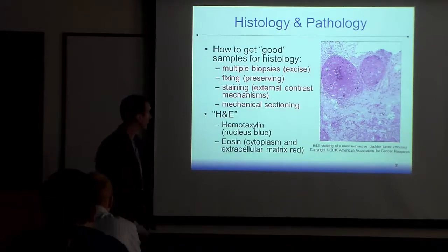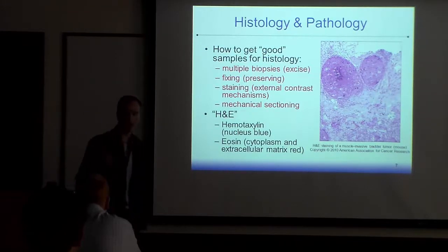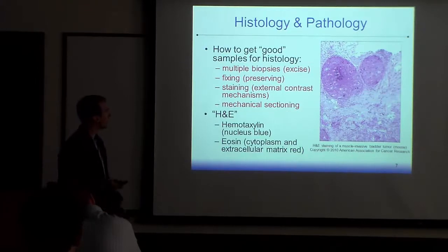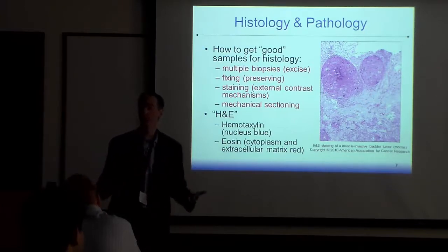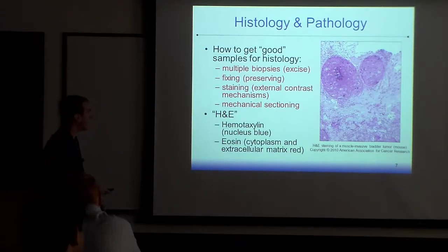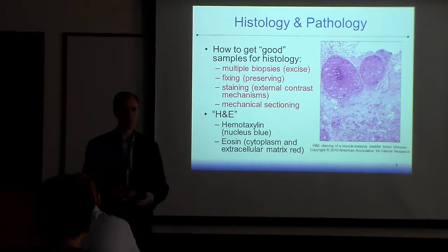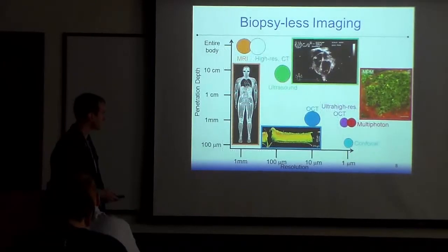Okay, so the things that I'm going to talk about and trying to address a little bit are these areas of, well, what can we do to reduce the need to cut out things. We want to look at stuff that's inside of tissue without actually having to remove the tissue, so we can look at it while it's still alive. We want to not fix it, and I will use some external contrast mechanisms, but we also want to look at what your tissue can do just naturally without having to label it, because there's a lot of information in there. And yeah, we don't want to have to slice up your tissue. You want to keep it intact while we're doing this, which is great also not just for diagnostics, but if you're doing mouse model studies of different diseases, you want to be able to see this progress over time and not have to chop up the mouse every time you need some image.